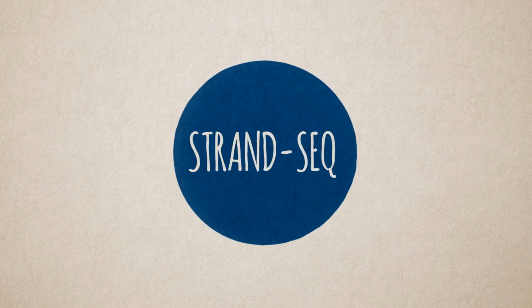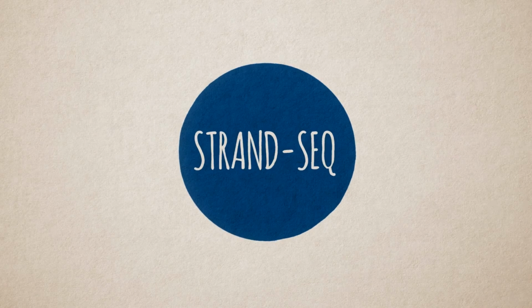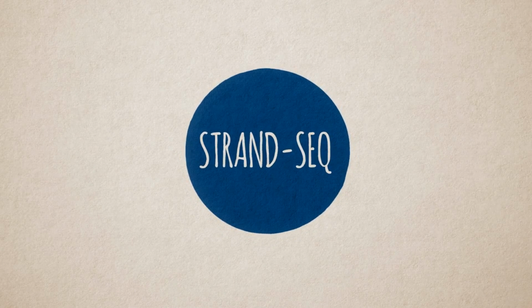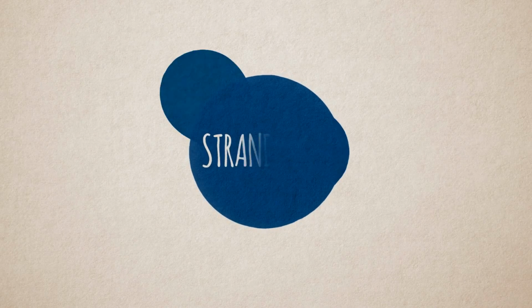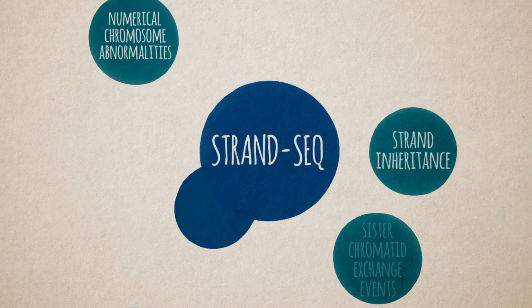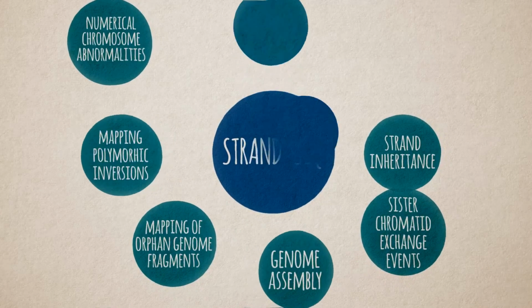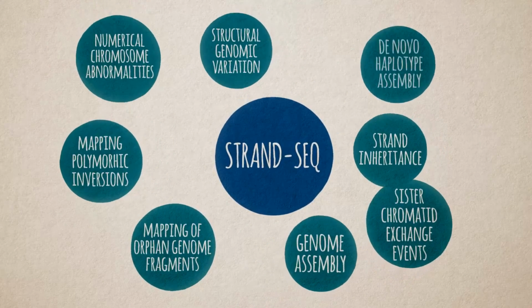Strand-seq is a very powerful tool for detecting not only DNA inheritance patterns, but also different types of chromosomal aberrations. As such, Strand-seq can be used to assess genomic instability at single-cell level, resulting in a much higher sensitivity than previously possible.